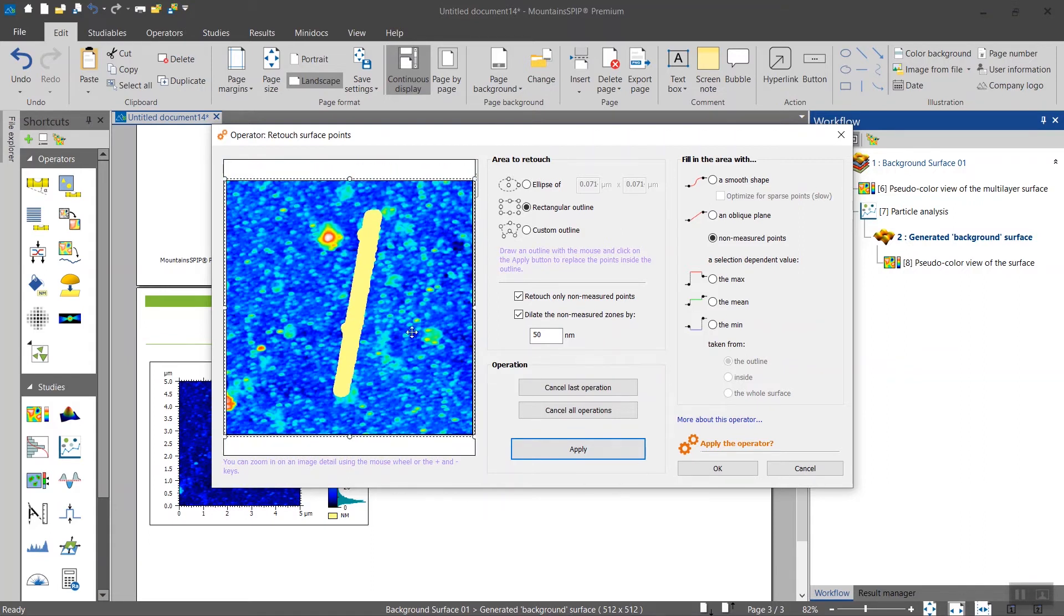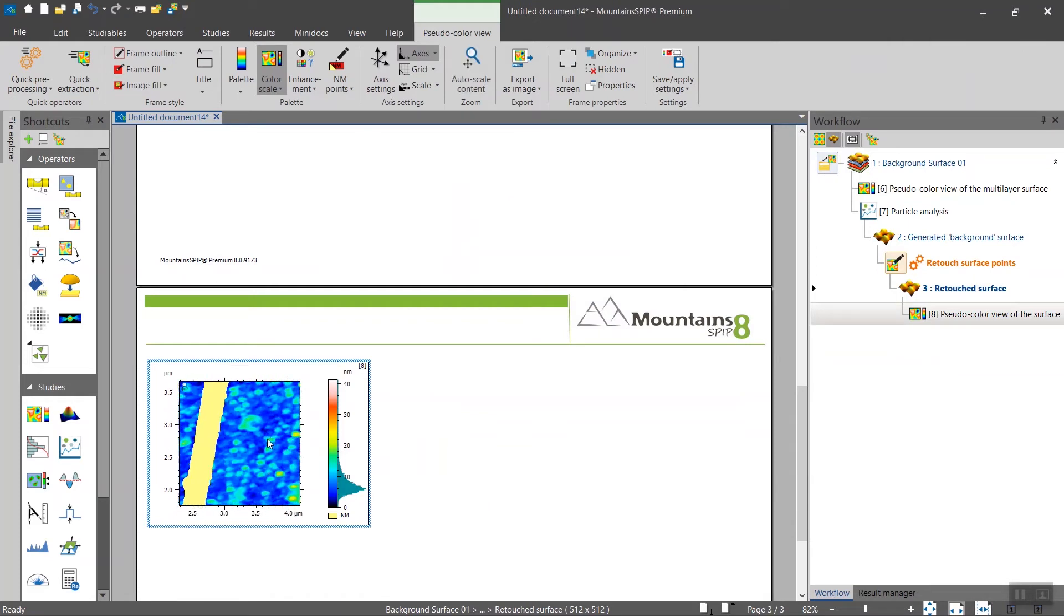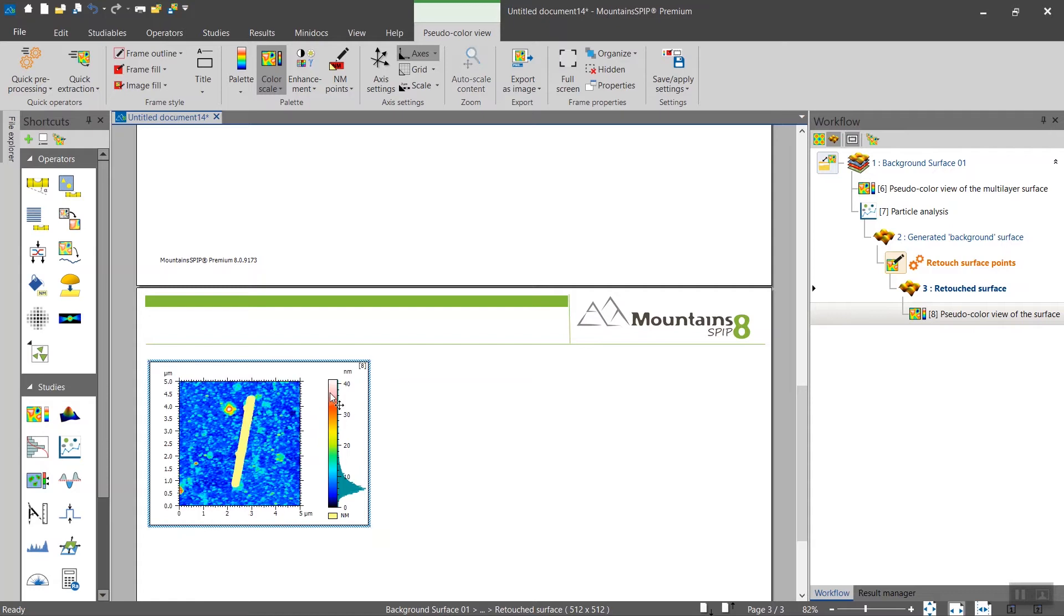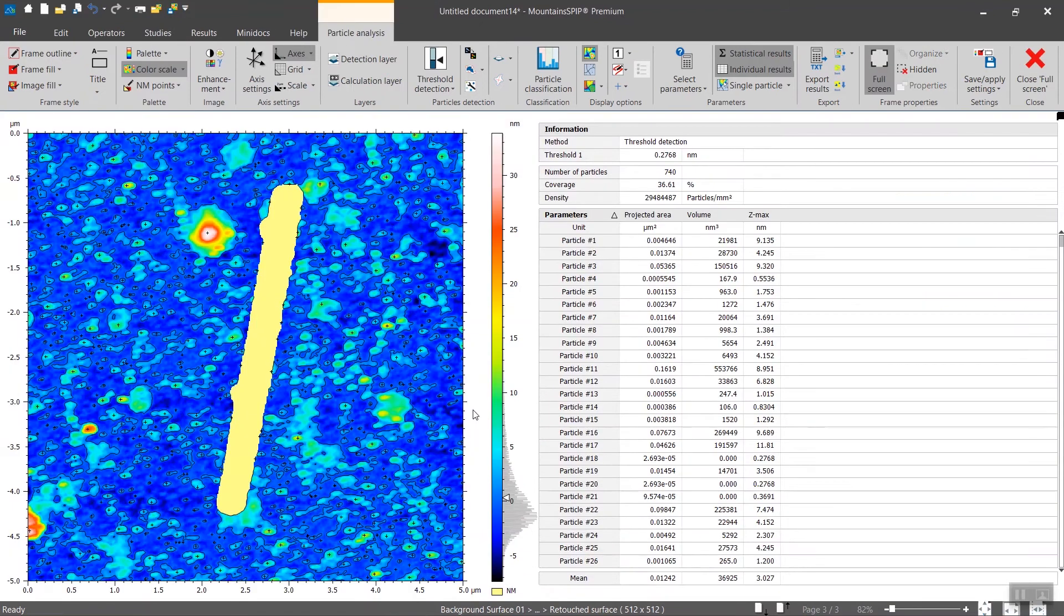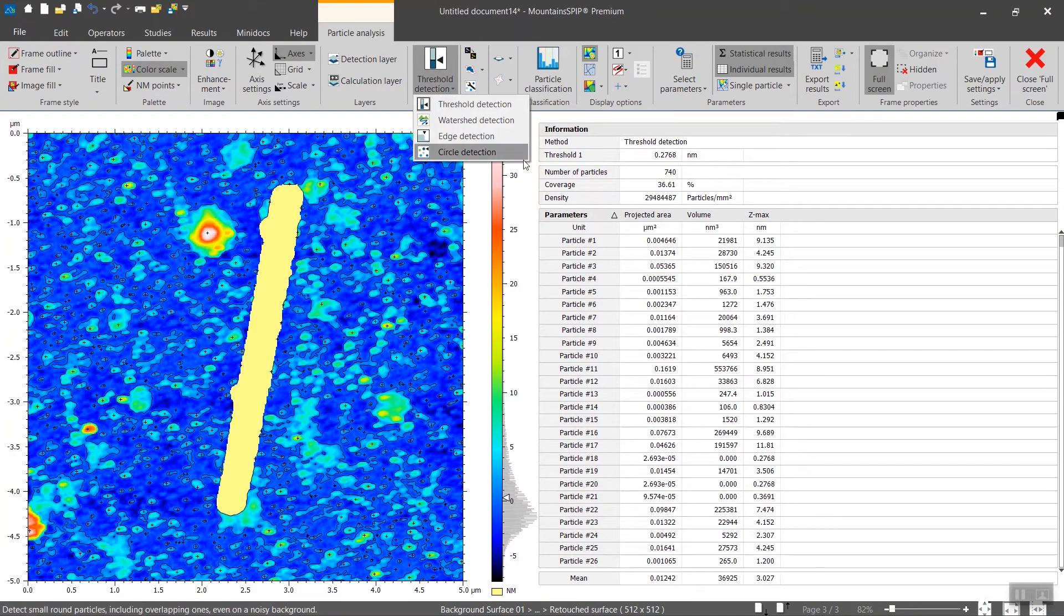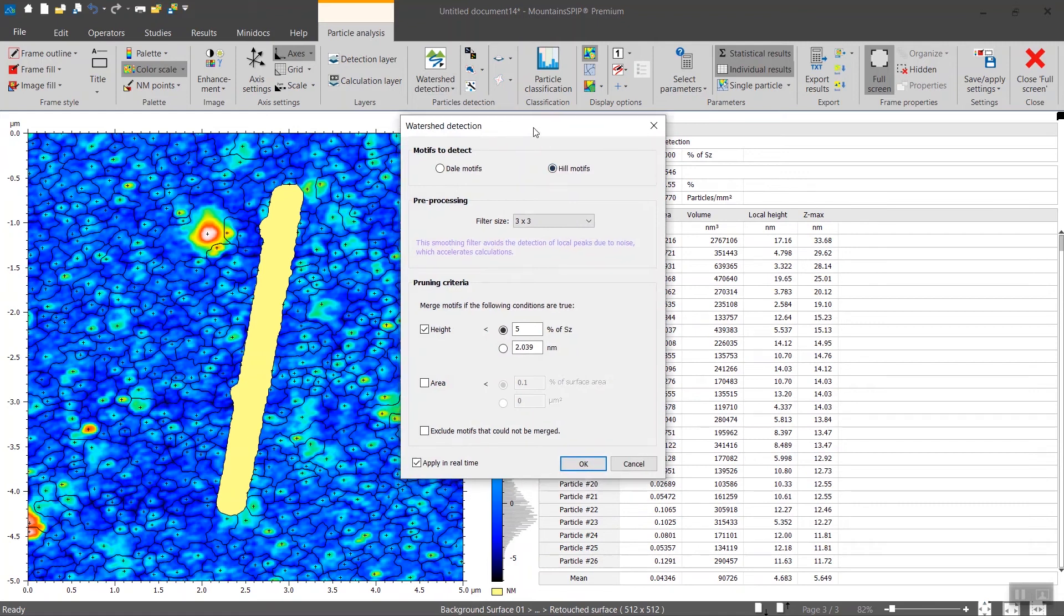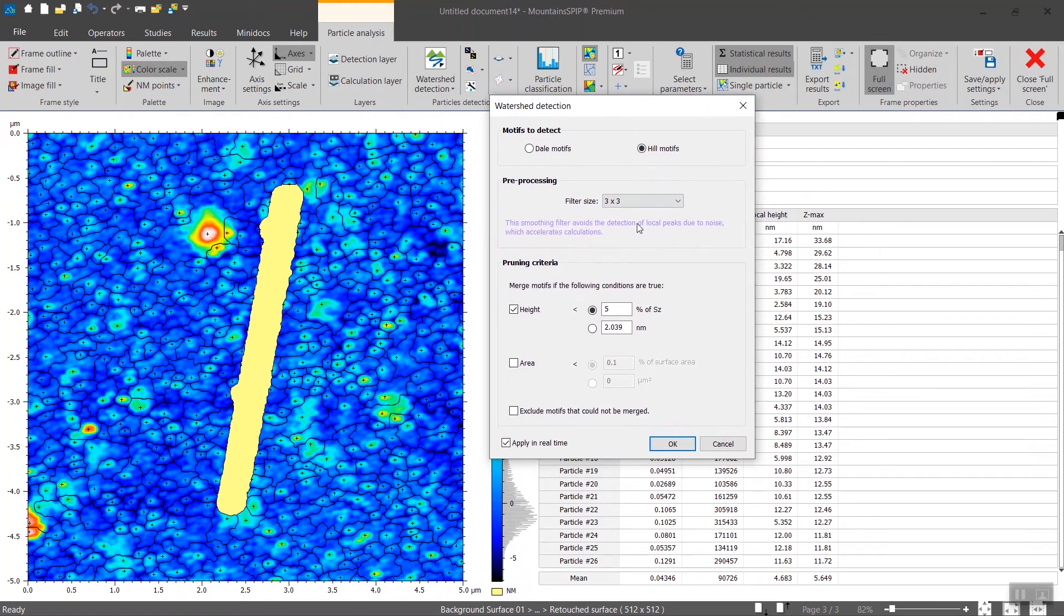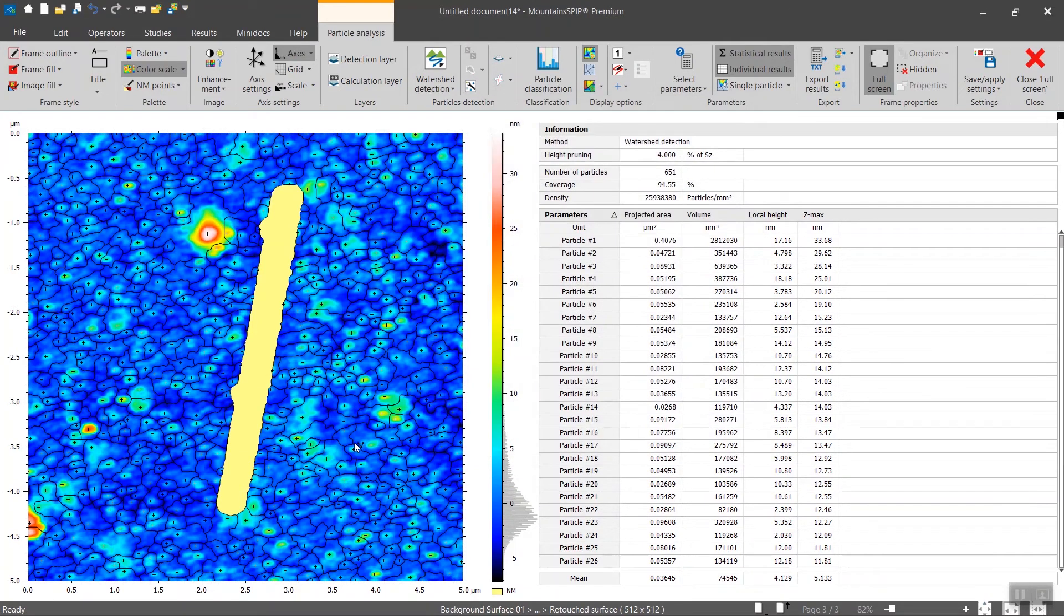If you're happy with the result you click on okay, and this is the result. You see lots of particles here which you can reuse for particle analysis. We could use a different algorithm, for instance the watershed detection, the hills, then maybe 4 percent, and then here is the result.